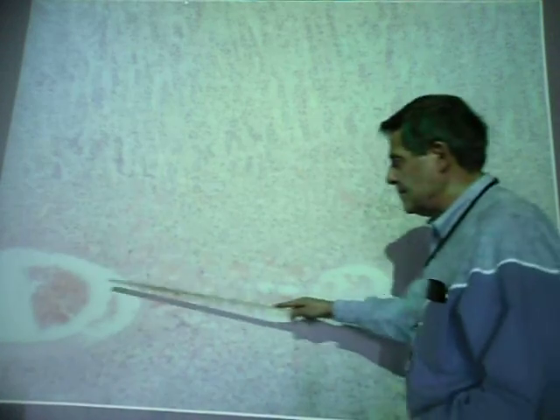The gland itself is divided into an outer region, which is called the cortex. That's what this is. This is all cortex. And then the inner region, which you see right here, which is the medulla. Like we see in a lot of organs, the outer part is often called the cortex, inner part the medulla. Now the medulla has a lot of blood vessels, you can see.